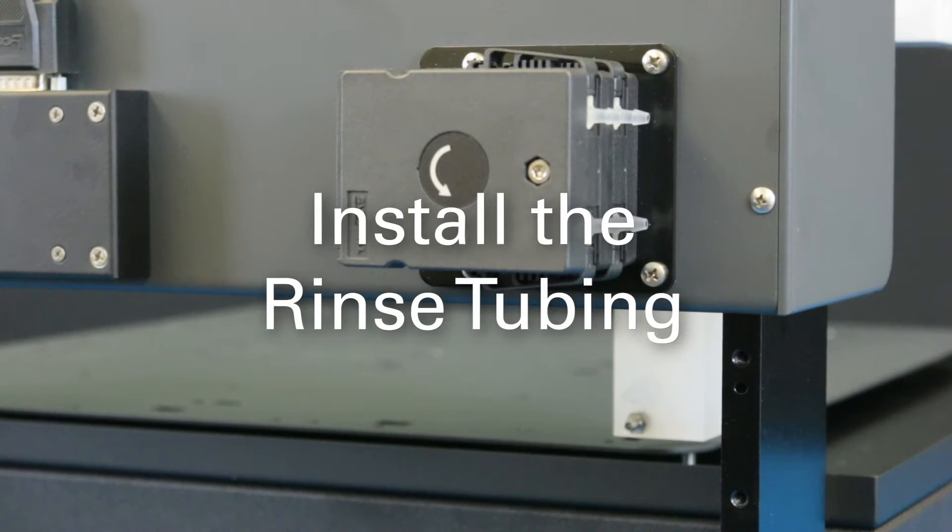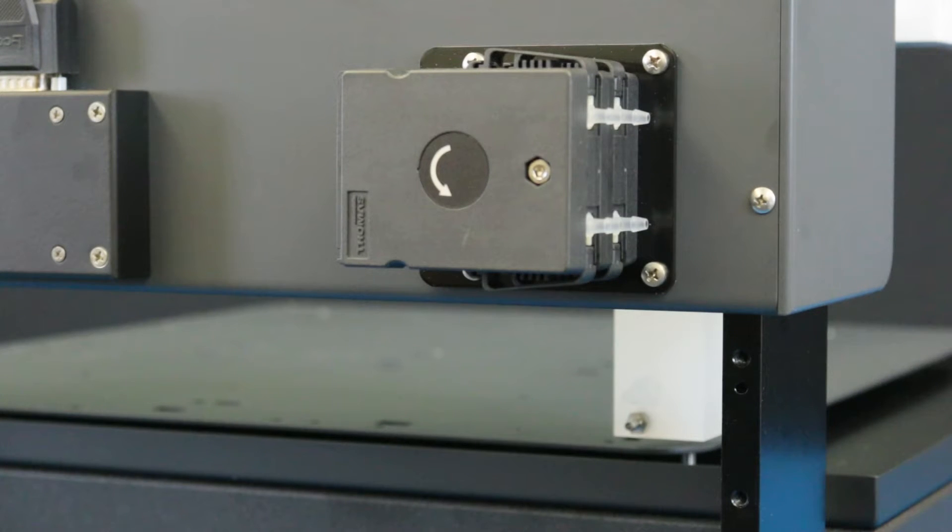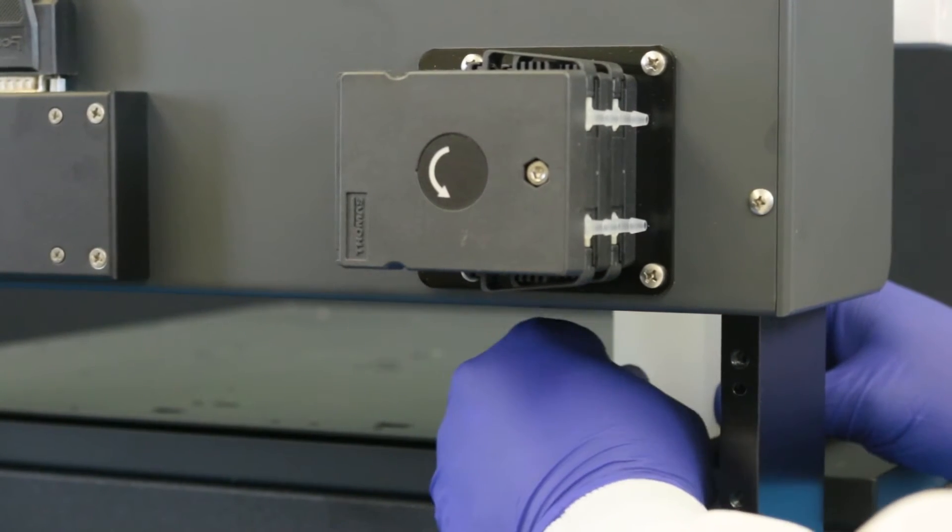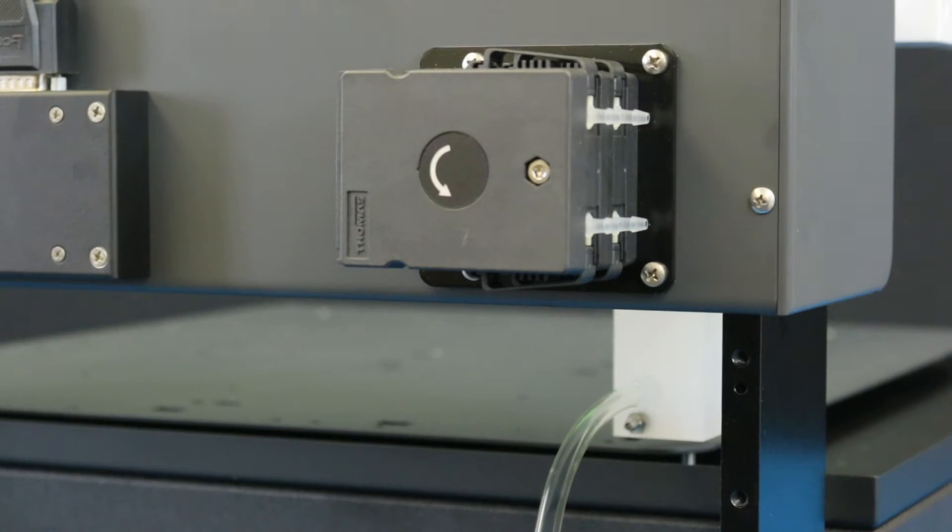Install the rinse tubing. Find the short piece of 3/16 inch waste tubing. Connect the waste tubing to the upper fitting of the rinse station. Direct the other end to an appropriate waste container.